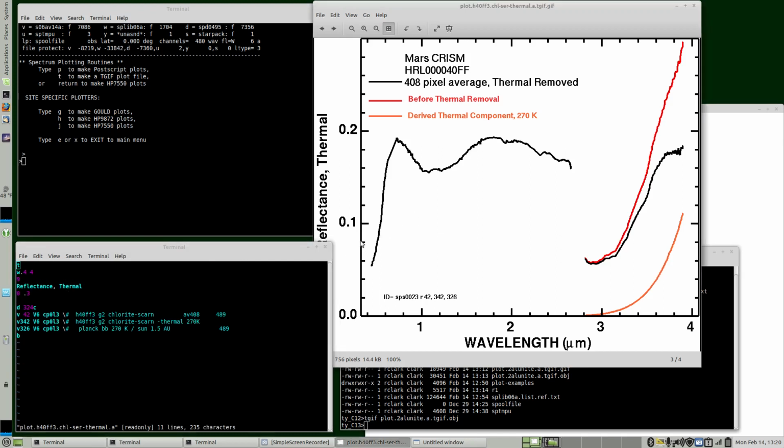This is actually a very simple plot. I didn't need to do anything special in offsetting because these are modeled spectra. But we did delete some channels that were spurious. In this case, channel 324. And then here's another example where using a small c. So the small c will connect points unless there's a gap caused by a deleted point. So the 324 is a point that's over in here. If I used a capital C or didn't delete that 324 value, there would be a line here, and it just looks artificial. So that's a choice you can make.